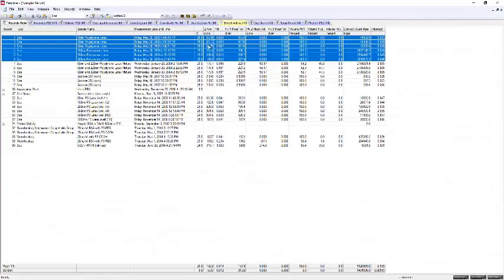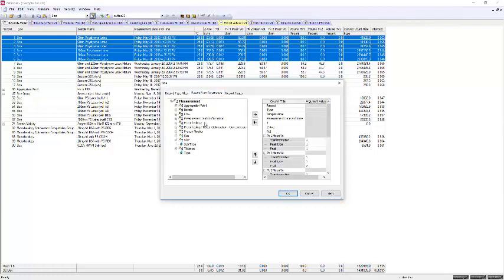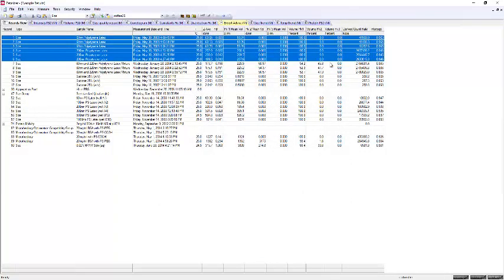If you want to further customize all of these different parameters and make your own table before exporting, you can go into customizing the workspace, which is found here, and you can add as many parameters as you would like. You see many different things listed here, including maybe D50 values, D80 values, or looking at the count rate, all of those things. Anyhow, I have customized this to what I like to see when I export the results.